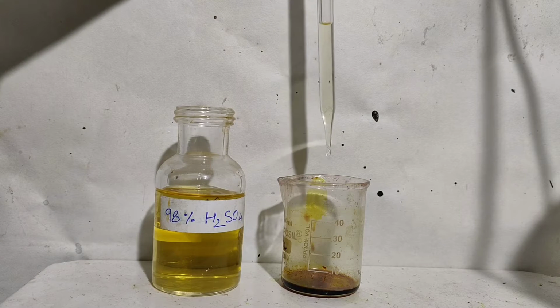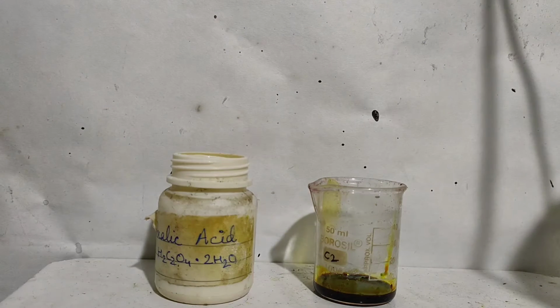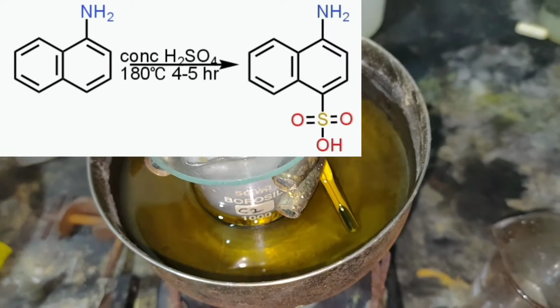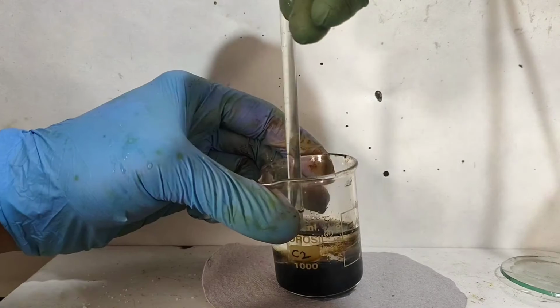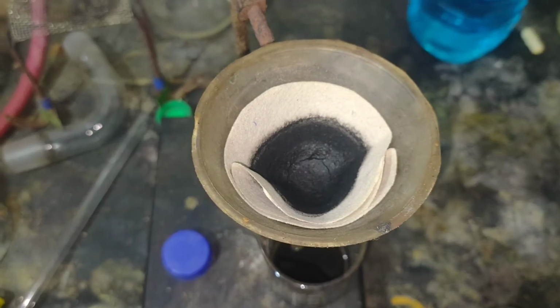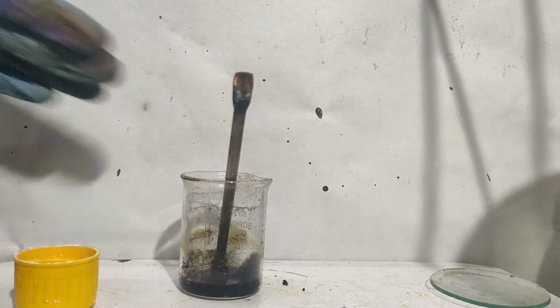To it, I added 2 ml of concentrated sulfuric acid for sulphonation and also added some oxalic acid as prescribed in Vogel's. Then I heated the mixture to 180 degrees Celsius for 4 hours. Then I added distilled water to it and stirred with a glass rod. I filtered it but could only see some black mass. To the black mass, I added sodium hydroxide solution and filtered.